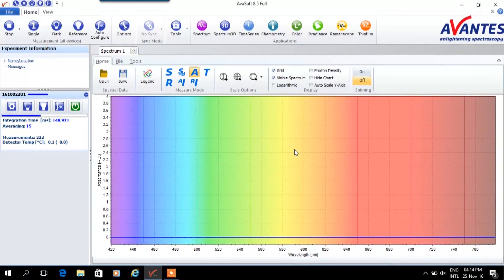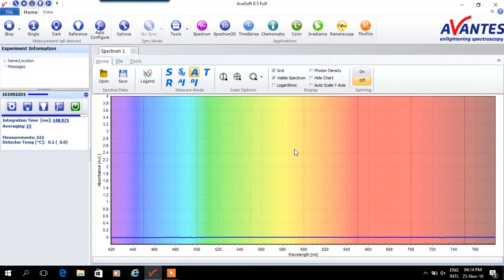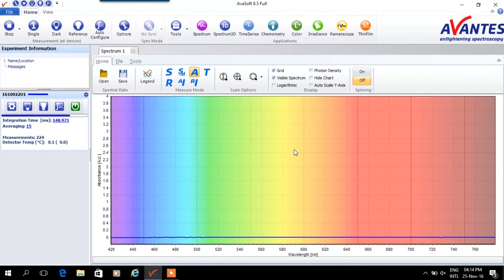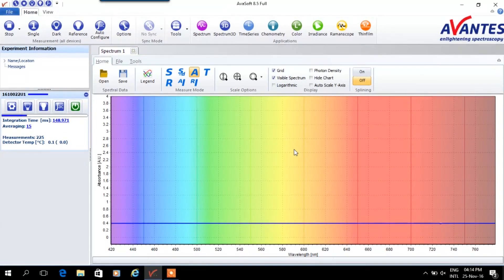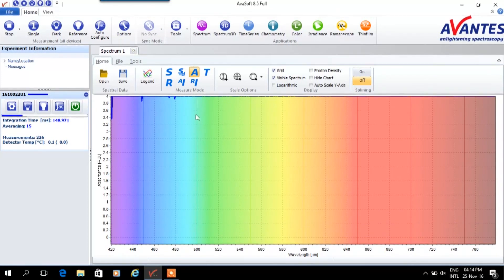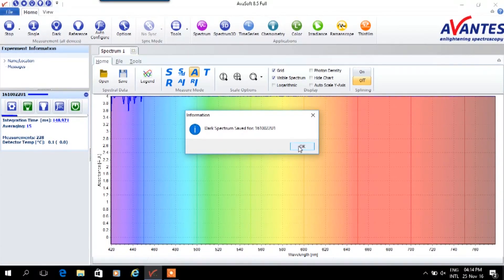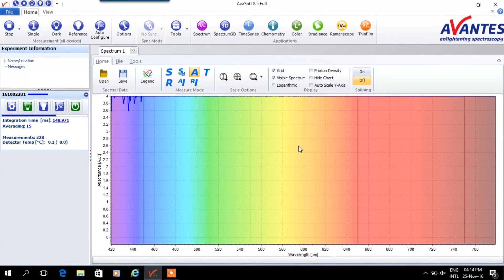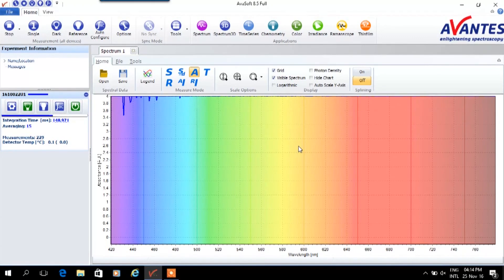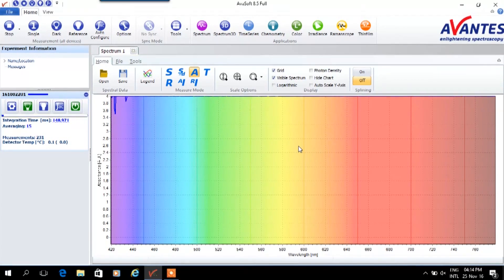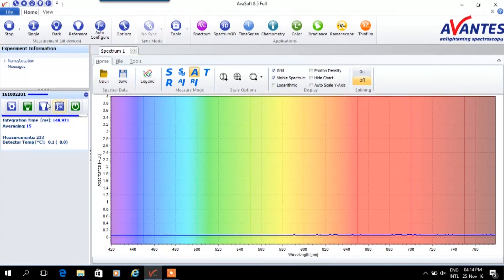When the measurement parameters are set we can switch to absorbance mode. It is recommended to take a dark measurement to eliminate ambient light effects. Before taking a dark measurement the light source needs to be switched off. After obtaining a correct dark measurement, the light source can be switched on and we are ready to take a white reference.